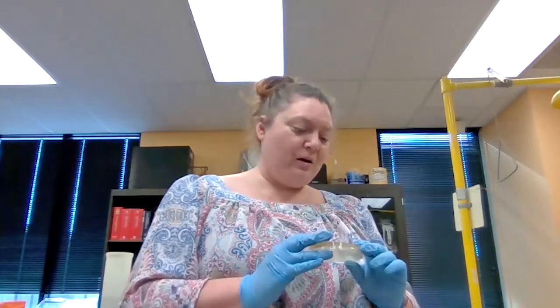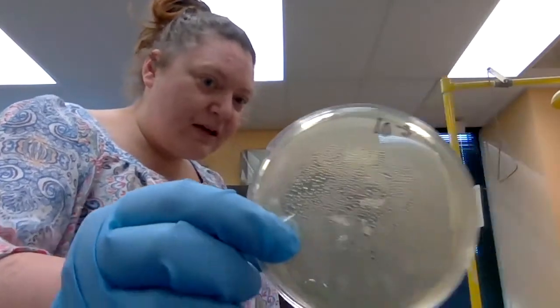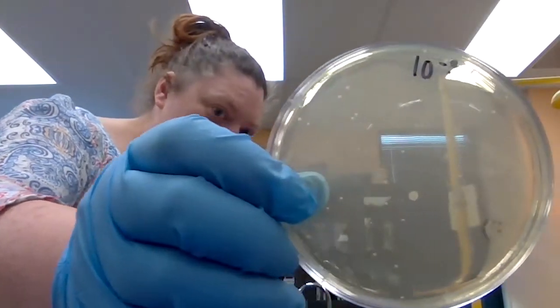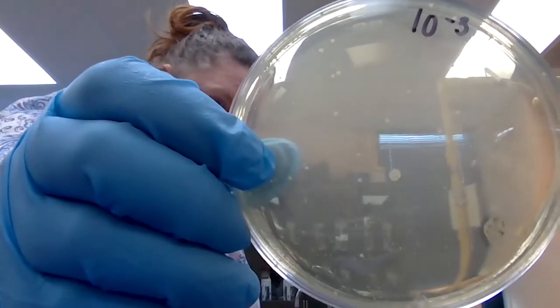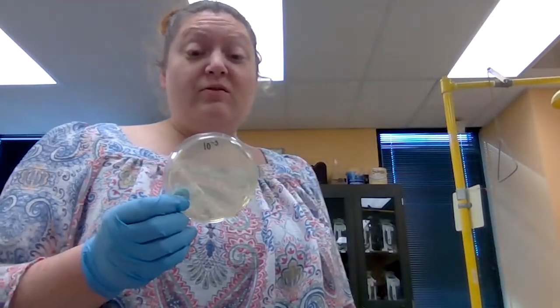So we have our other dilution. Maybe there's 30 to 300 colonies in there. I don't know. I'm a little disturbed that there's that much bacteria on my Taco Bell taco to begin with. But we'll take a look at 10 to the negative 3. One moment, we have a little bit of condensation going on here. There we go, you might be able to see it a little better. 10 to the negative 3. We still have way too many colonies to count. They're all very small. Some are big, but some are very, very tiny little pinpricks. We would have had to dilute it even further to get a plate that we could count, because there's just so much bacteria in here.